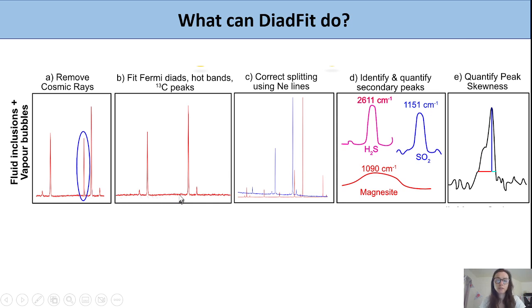Let's look at the workflow for fitting spectra with the Fermi Dyad. The first thing it can do, if your instrument hasn't already, is remove cosmic rays.